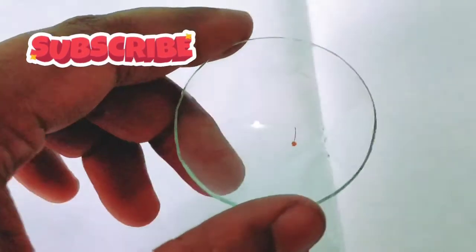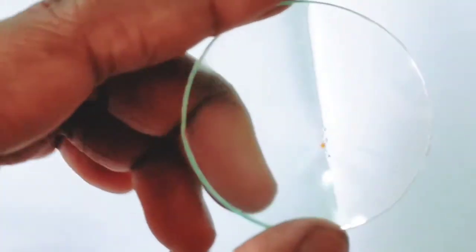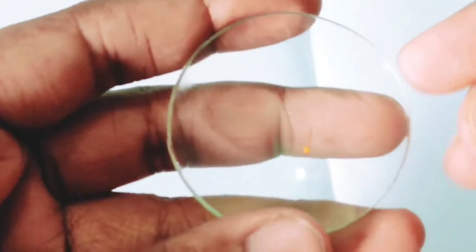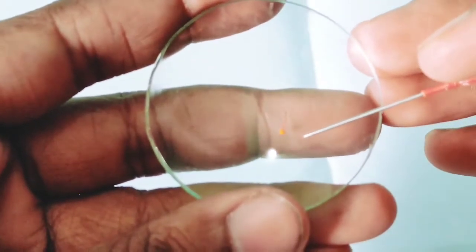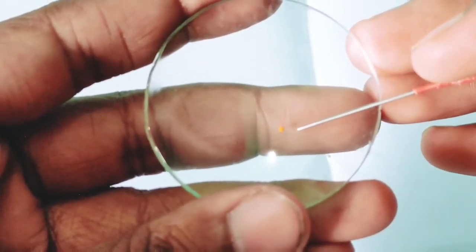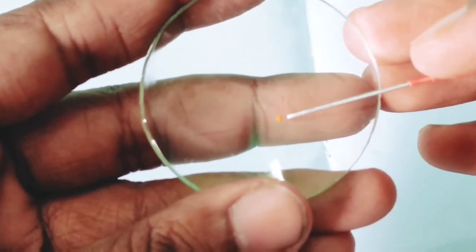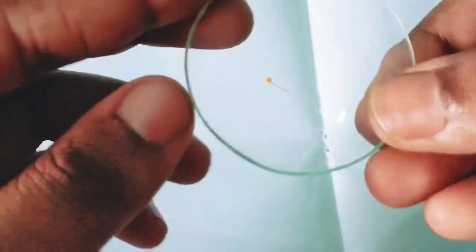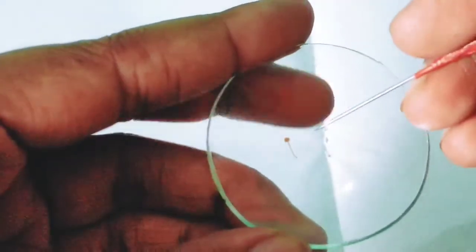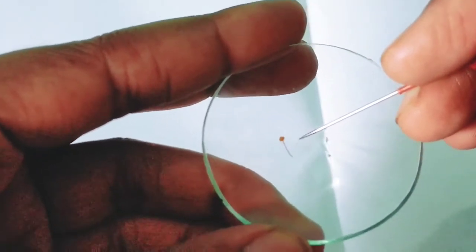I have taken the androecium in a dish. So it is the androecium, the male reproductive part. This has an anther at the tip. It is an anther, and it is a filament.